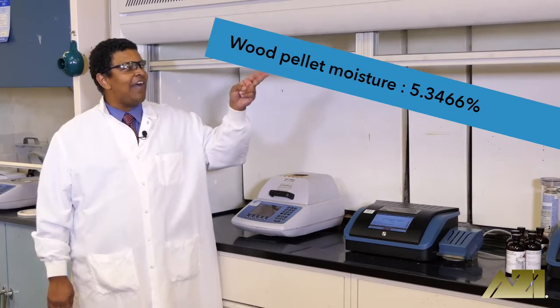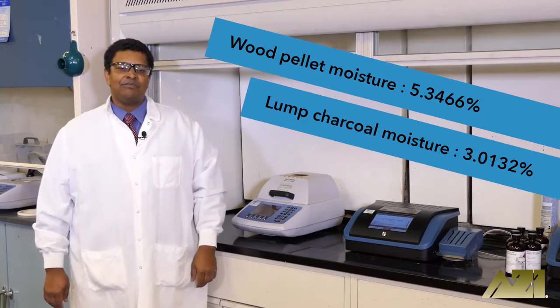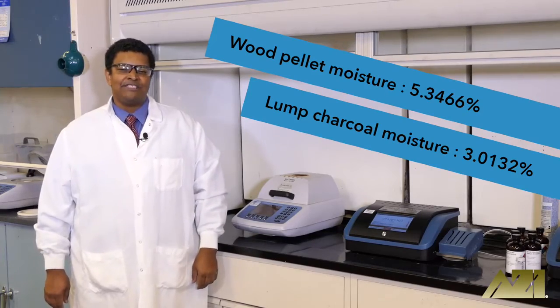With our test completed, you can see that the wood pellets have approximately 75% more moisture than the lump charcoal. This could be due to different drying specifications.